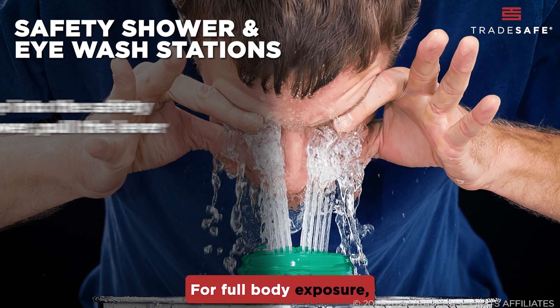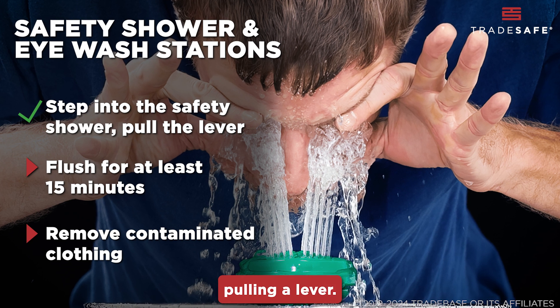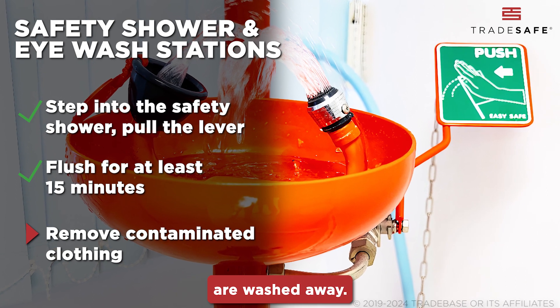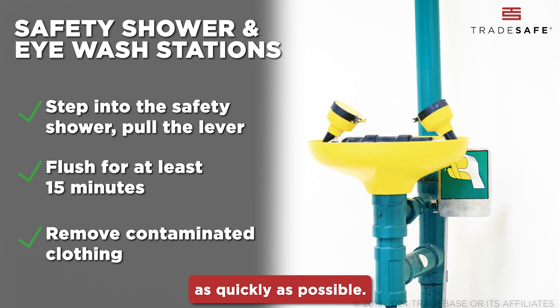For full body exposure, step into the safety shower and activate it, usually done by pulling a lever. Flush affected areas for at least 15 minutes to ensure all contaminants are washed away. Remove any clothing that may have been contaminated as quickly as possible.